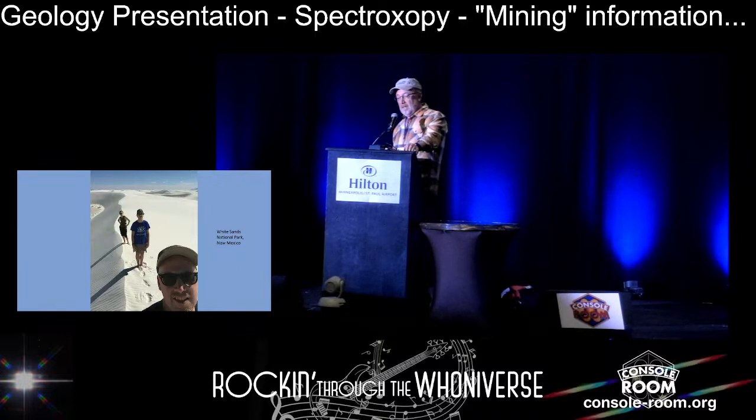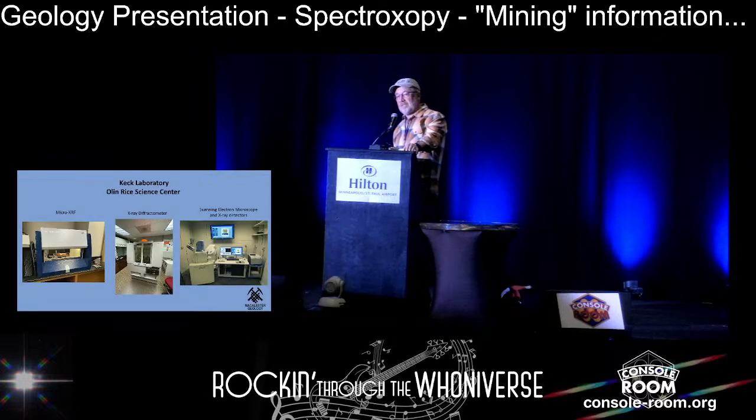So here are some of the tools that we have. I was just telling John that I don't want to retire because I don't want to lose access to these things. And I use them all the time for lots and lots of different things. What I thought I'd do is describe how we use them, how they operate to some extent, and then give a specific example, and connect to one of these instruments at the end to help answer a question.